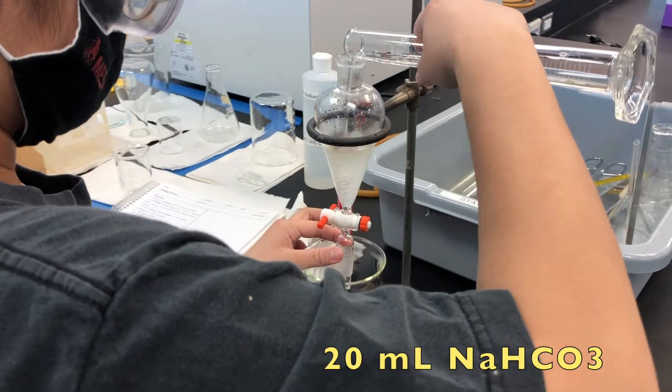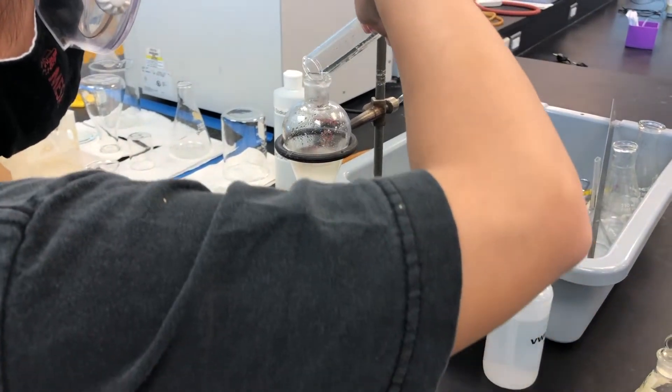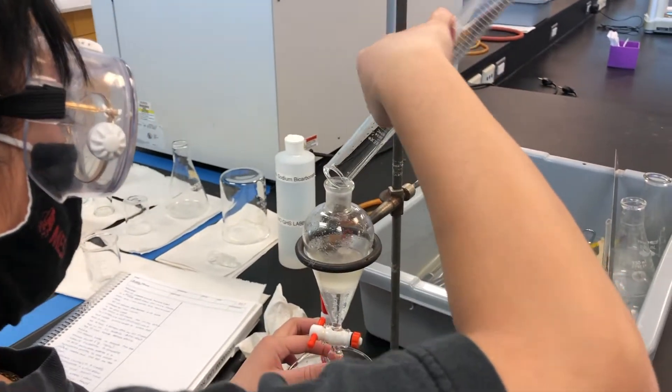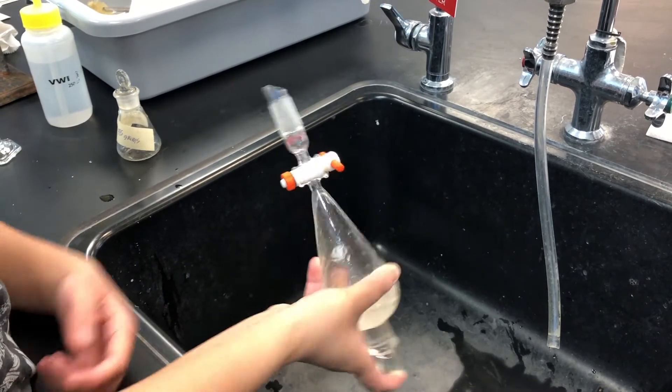Add 20 milliliters of 5% sodium bicarbonate to the separatory funnel with the organic layer. Place the stopper on, mix and vent multiple times, then wait for it to settle once again.